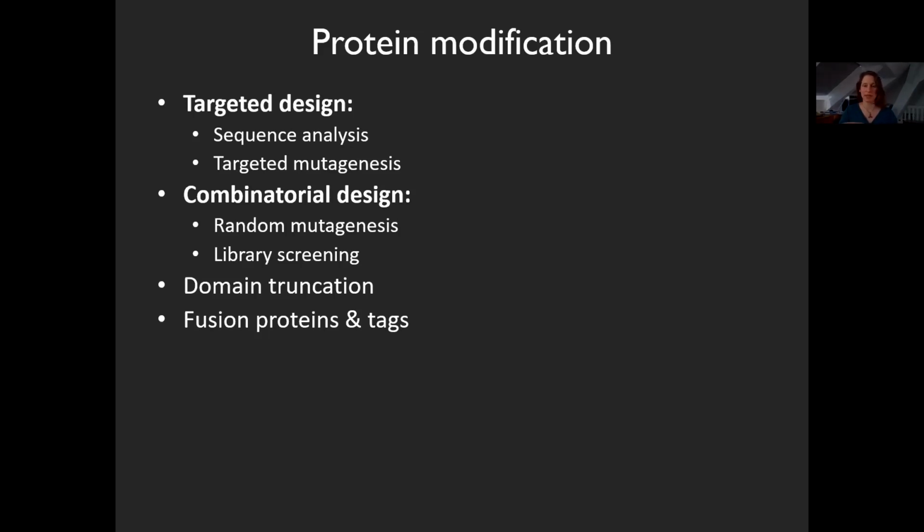My personal opinion is that tags are not detrimental to crystallization. However, again, this is only gut feeling. There is no systematic study of this.